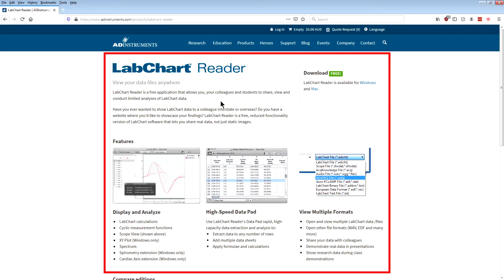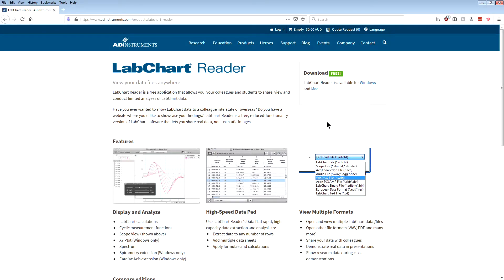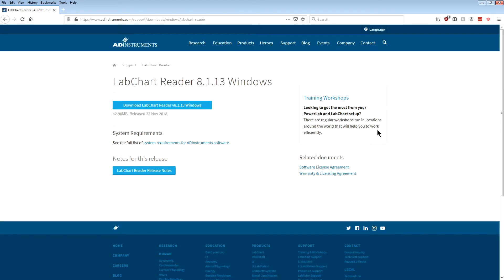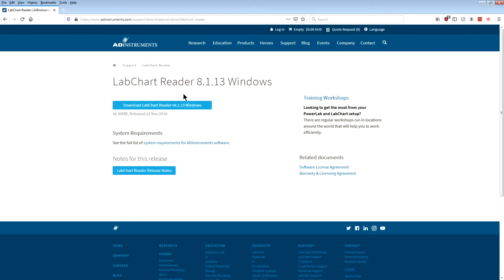This page here tells you about LabChart Reader. To actually get the download, just go up here into the top right hand corner and there's a version for Windows and Mac. I've got a Windows computer, so I'm just going to click on this link here, and this is the page where you download the software. Just click on this button and the installer will download, and then just install that on your computer. I've already got it on my computer, so I won't download it again.